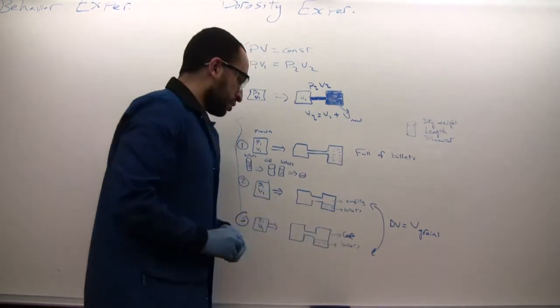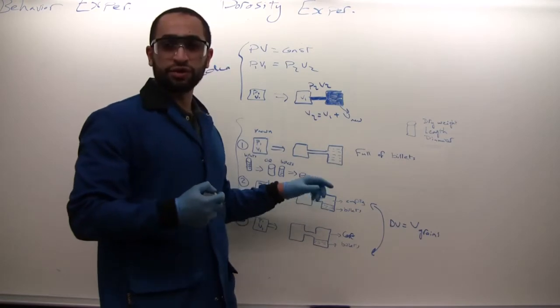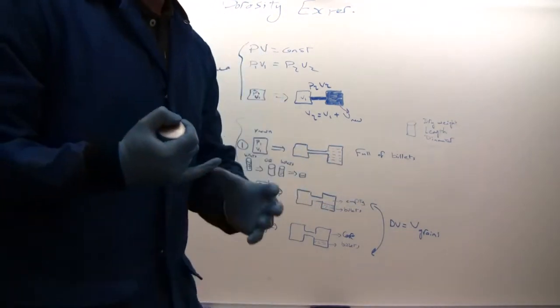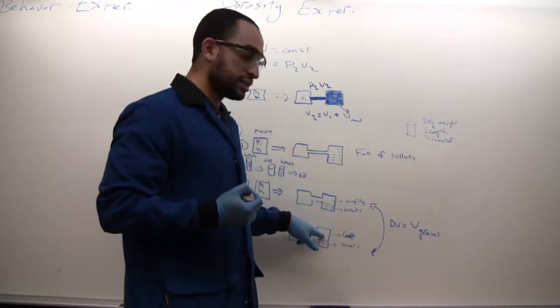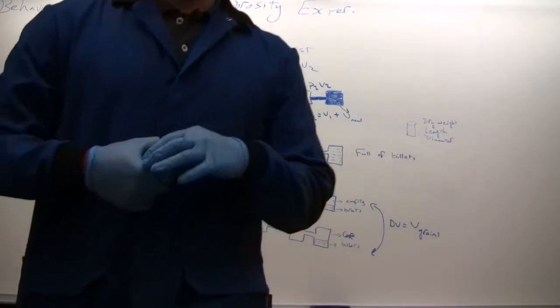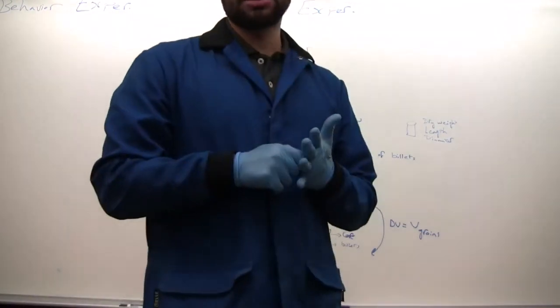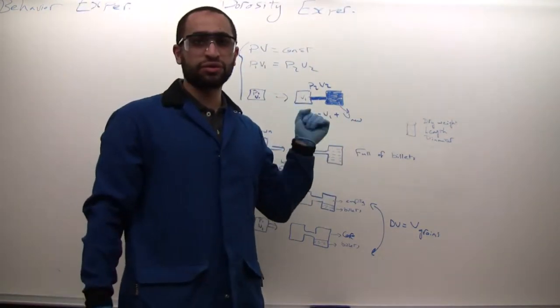So in this case, when we do that, we can get a reference volume before I put my core. This reference volume says that from this law we will be able to know the volume of everything except for the grains of the rock that are going to occupy this space in the future. So usually the equations are easy or are forward ones. You will find them in your handouts, but this is just the principle of work or the idea of the experiment.